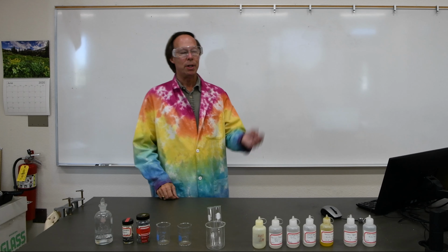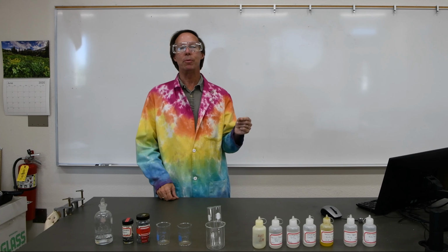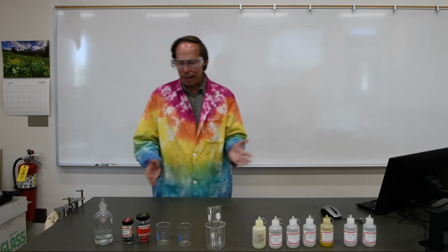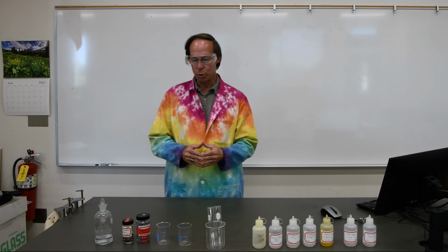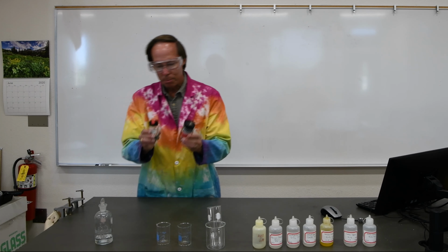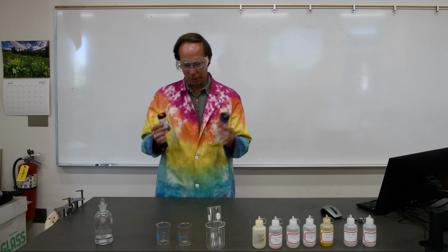In some groups, as you go down the group, the elements become more reactive. In some groups, as you go down the group, they become less reactive. So your task today will be to determine what the case is for group 2. In part A of the lab, we're going to be looking at magnesium and calcium, two of the members of the group 2 elements. And we're going to be trying to do two things.